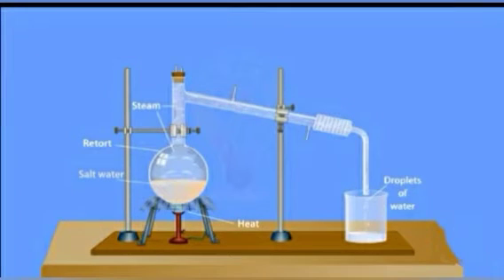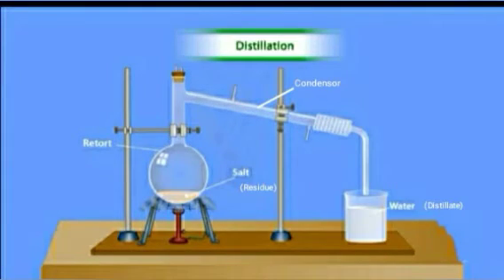We will see the steam getting collected inside the beaker in the form of droplets of water. The steam condenses in the condenser and reaches the beaker and the salt is left behind in the retort.